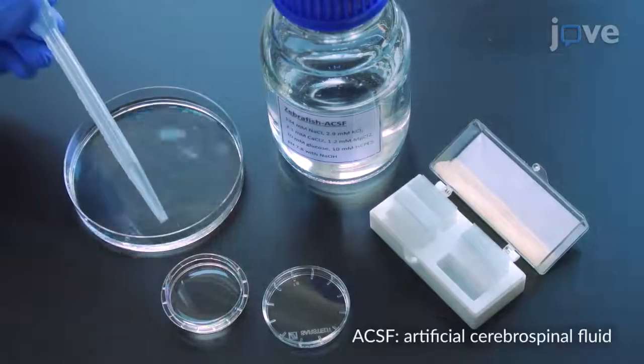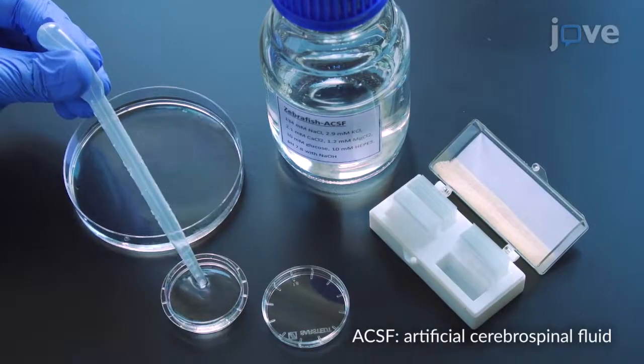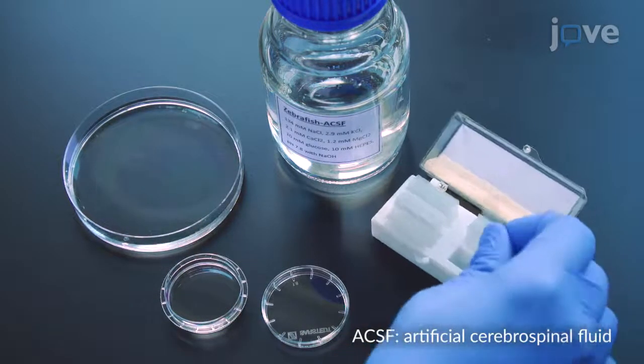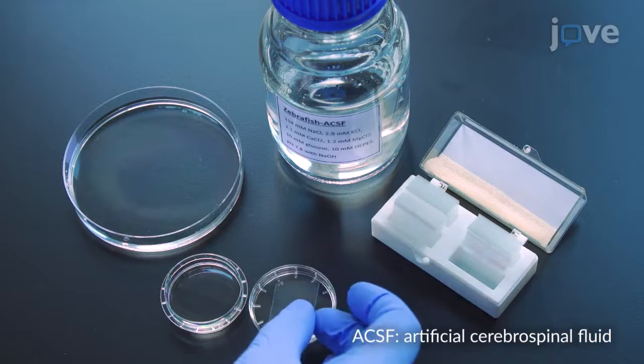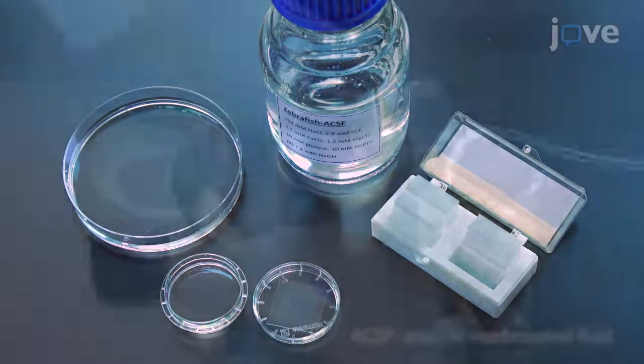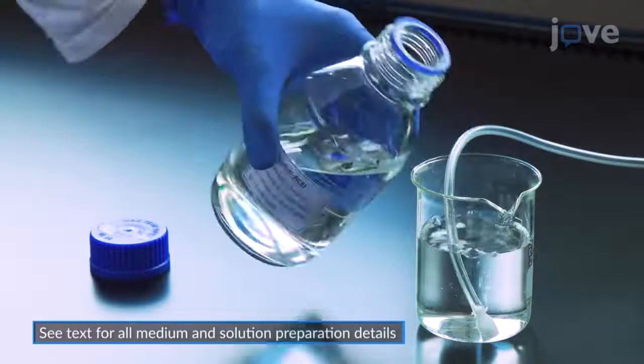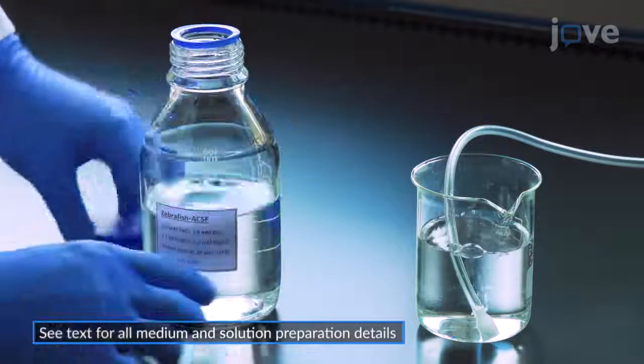Transfer the selected larvae to a 35mm diameter petri dish containing ACSF and place a 24x24mm square glass cover slip into the petri dish lid. Then aliquot the volume of ACSF needed for the experiment into an appropriate vial for oxygenation with carbogen.